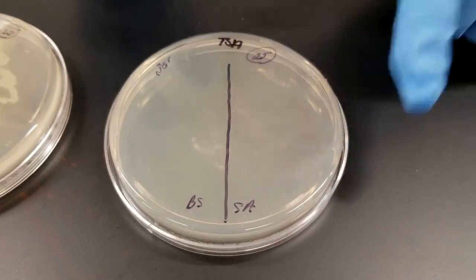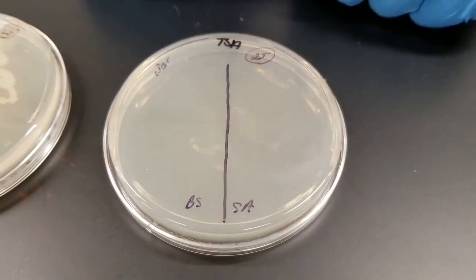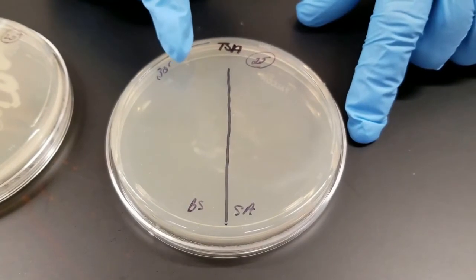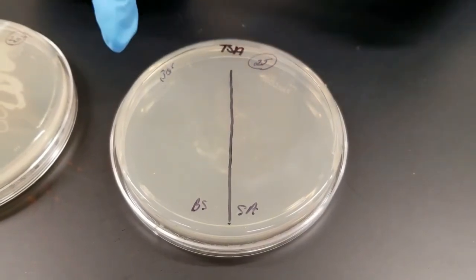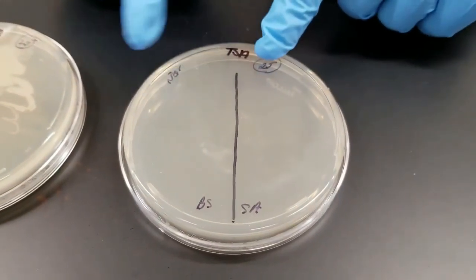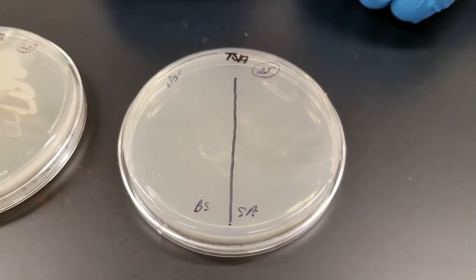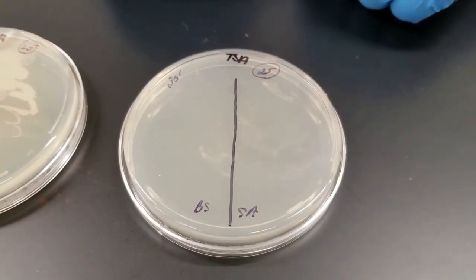The Staphylococcus aureus was not able to survive the UV light at all on any of the time limits. Bacillus subtilis, it was able to survive 10 minutes, but you can definitely see the difference between 10 and 30 minutes. 30 minutes exposure killed not only the vegetative cell, but it also killed the spores.